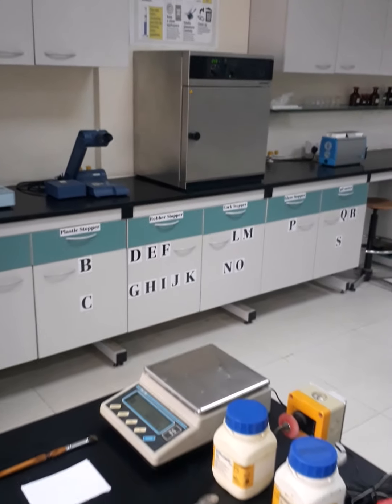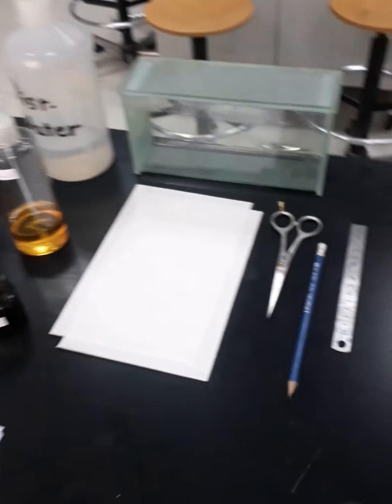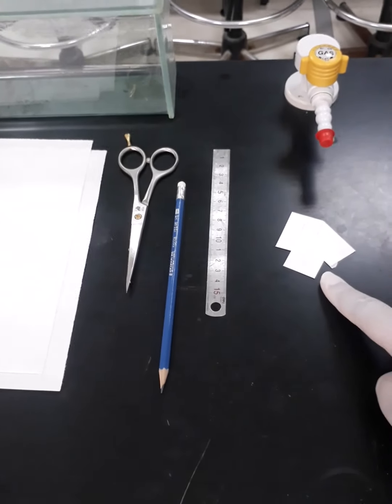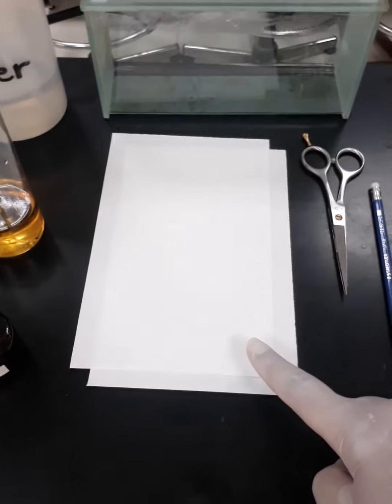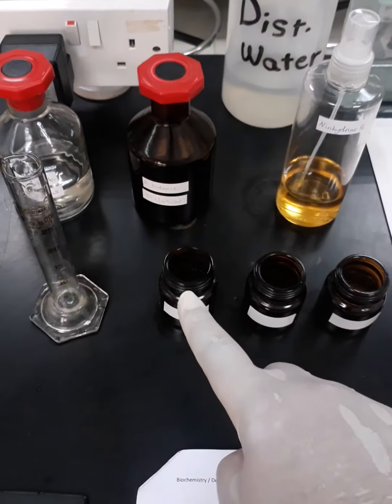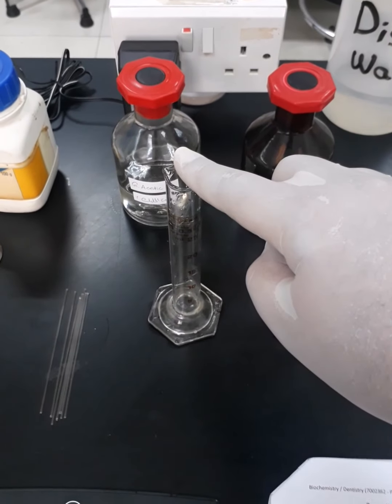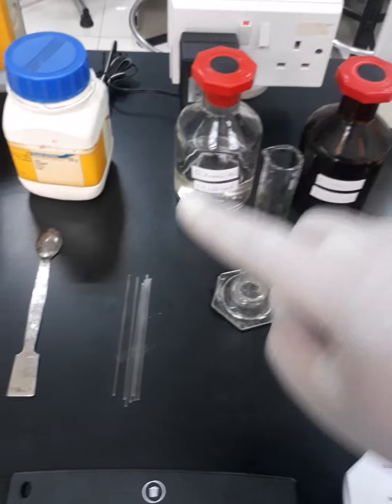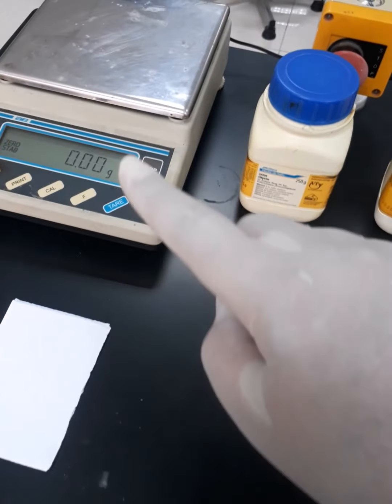Before proceeding with this experimental session, we have to make sure that we have all the chemicals and instruments available at our disposal. Here we have the labels, ruler, pencil, scissor, chromatographic paper, chromatographic tank, 3 containers of total capacity of 25 ml, measuring cylinder of total capacity of 25 ml, capillary tube, spatula, weighing paper, top-loading balance.